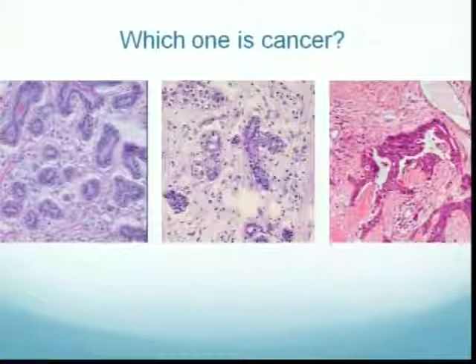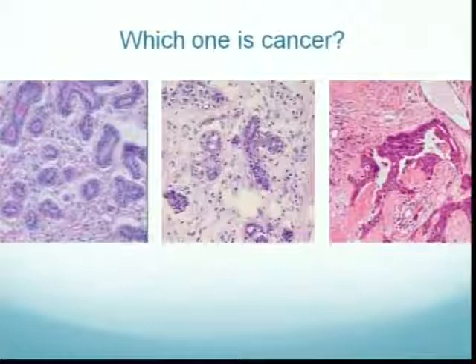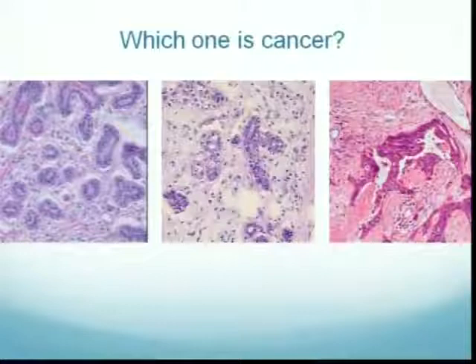Well, I can tell you right now, I can think of three papers, Nature, New England Journal of Medicine, and PNAS, of people making broad claims on tumor tissues that have recently been rebuffed because it was found out they had tons of normal tissue in it. I think this is a very important process. A lot of people forget this process. Your tumor cellularity needs to be homogeneous, and when you do your tissues, you need to really do a good job of making sure you have a high tumor content.